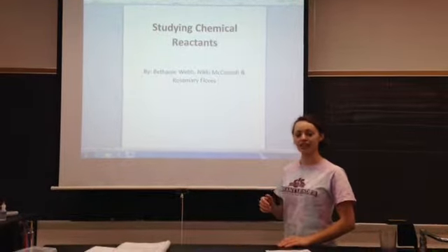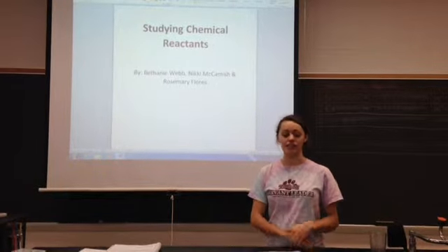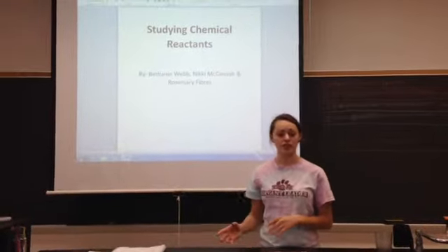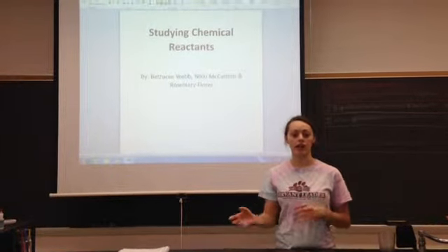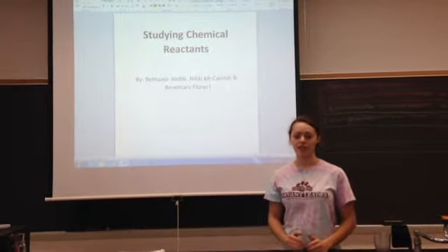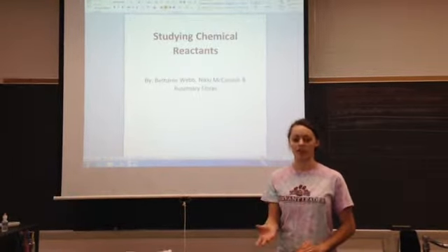This was an experiment that we conducted within our chemistry laboratory. We also have a class accompanying that, which is our chemistry lecture. Within this lecture, we are learning how to balance chemical equations in false situations pre-created by the creators of our chemistry schoolbooks. Lab is helpful to us because we get to see how to apply these chemical equations and reactions into situations that we are conducting as we do it.